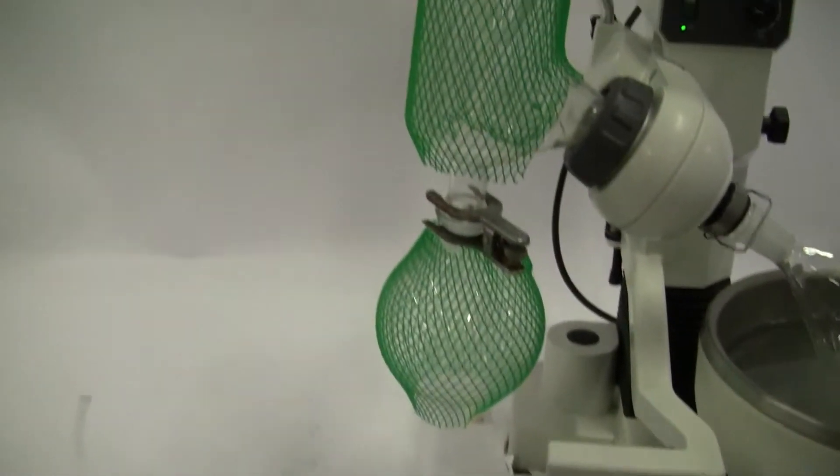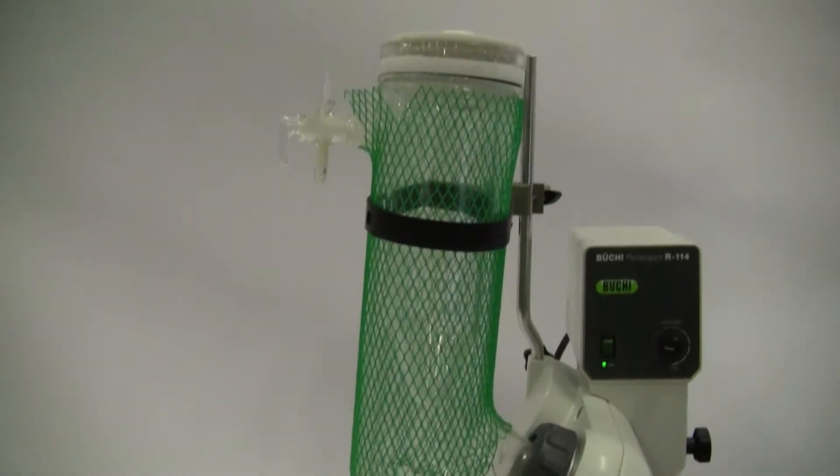Let's take a peek at the inside of our water bath. Free from corrosion. We're looking good in there. And our glassware. Complete cold trap setup.